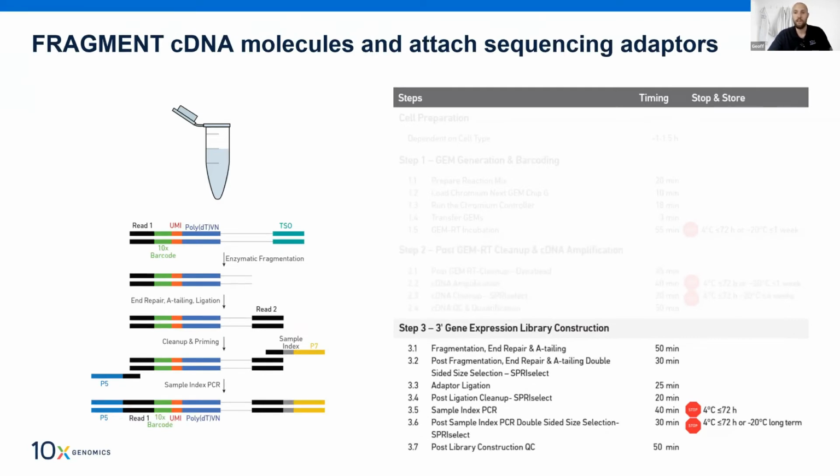However, in the final stages of our library preparation, we now lose, or as I like to think of it, compress this full-length information. We have to shear down our full-length molecules to much shorter fragments so they're compatible with short-read sequences. Although then we read each molecule with base pair resolution on the sequencer, at the end of the day, we compress this information down yet again to just assigning the molecule to a gene and giving it a count. But what if sequencing the full length of the transcript was really important to you? Or really, how can you access this information?